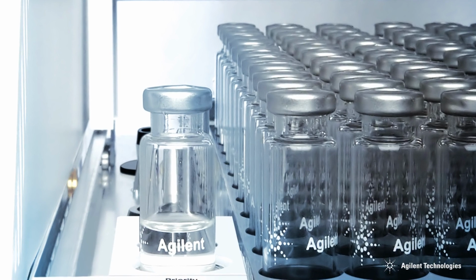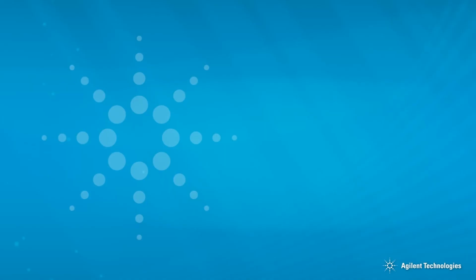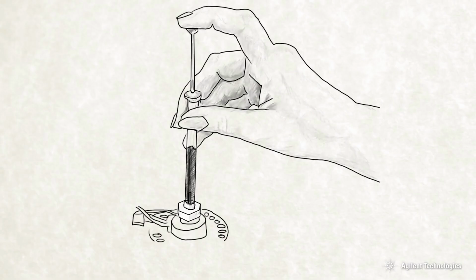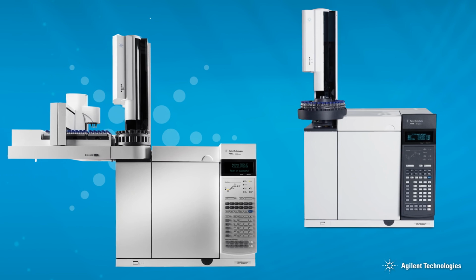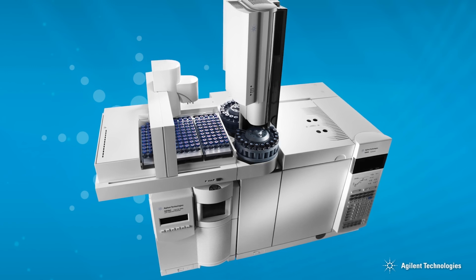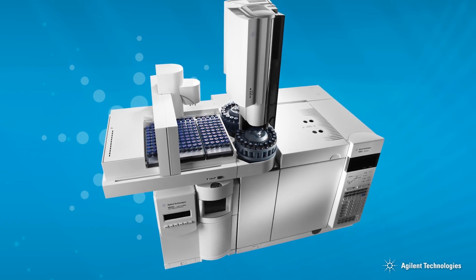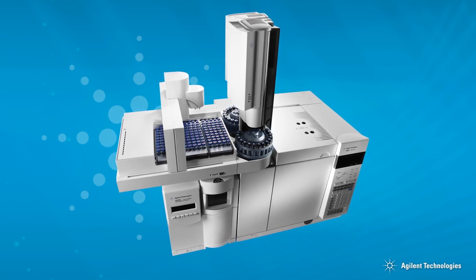When injecting liquids, the speed at which the liquid enters the heated GC inlet is important. The liquid must be injected out of the syringe before it is heated and evaporates from the syringe needle. Otherwise, variable amounts of sample will make it onto the column. The need to inject quickly into the hot inlet has led to the importance and ubiquity of autosamplers. Using an autosampler allows for up to 150 samples to be analyzed automatically and to ensure that exactly the same amount of sample gets injected every time.